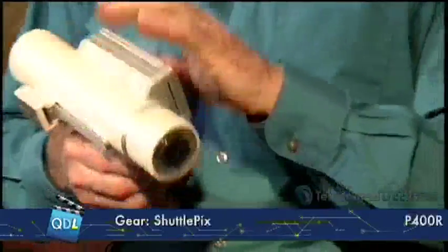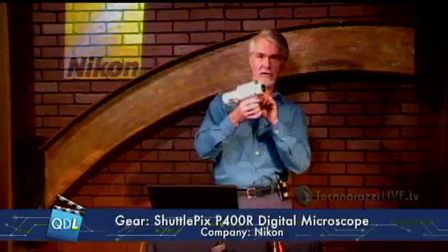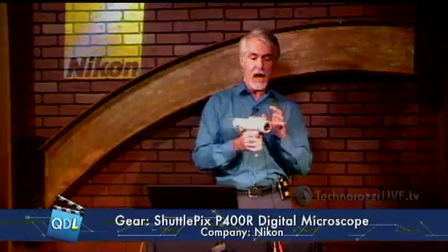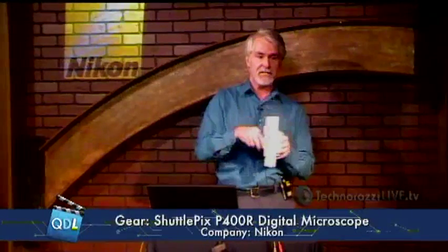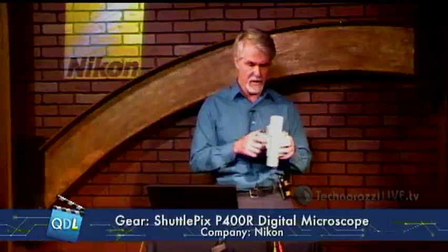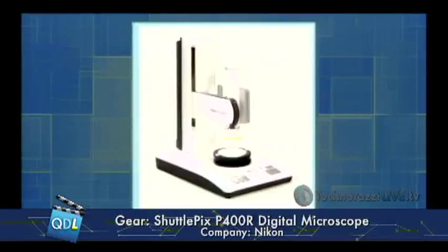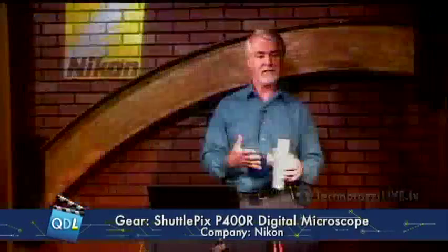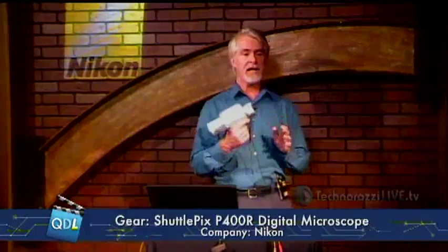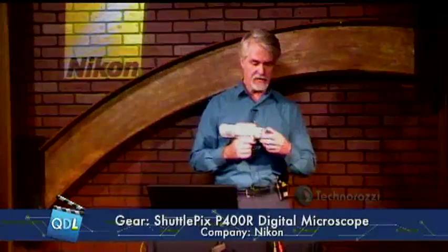They call this the Shuttlepix because it can be used standalone, just as you see it here with a video cable, but it can also mount in a stand. It can go into a motorized stand or a manual stand, so you can use it as a desktop microscope or take it out and use it portably.